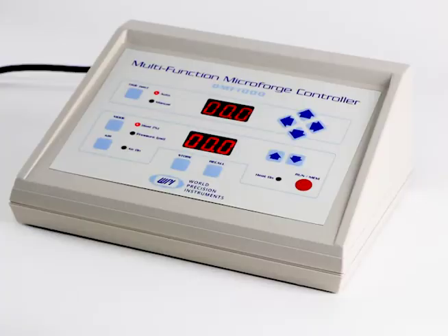After initialization, the setting that has been stored in the memory location 0 displays. The heat and timer displays illuminate, indicating that the unit is powered up. The first time the unit is turned on, both readouts display 000. The time selection is set to auto, the mode selection is heat, the air on light is off, and the heat on light is off.